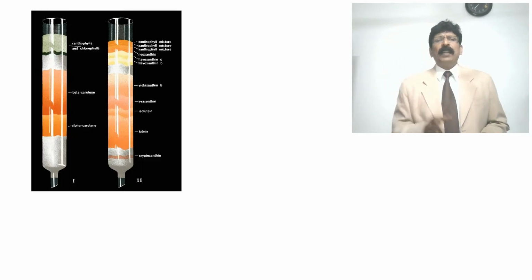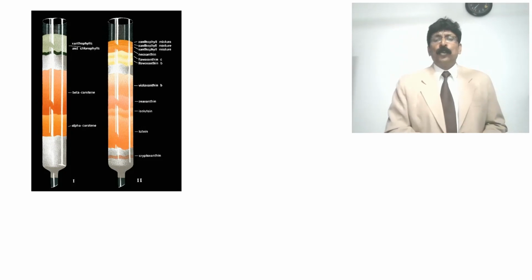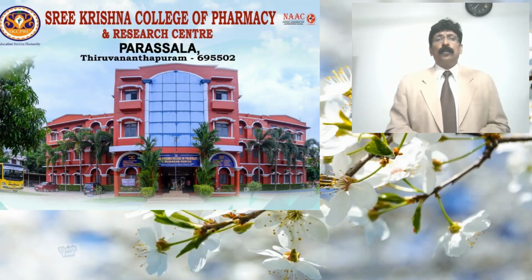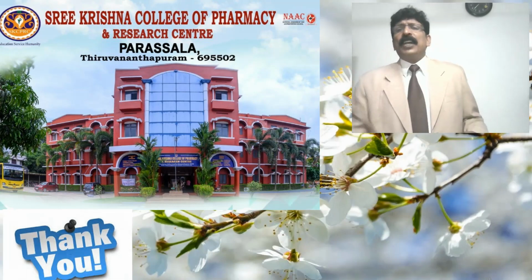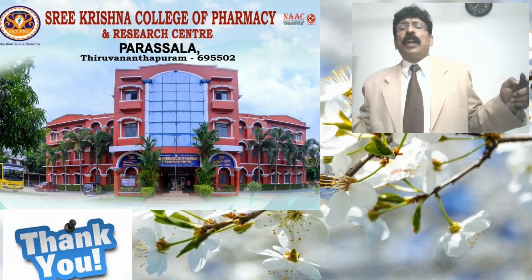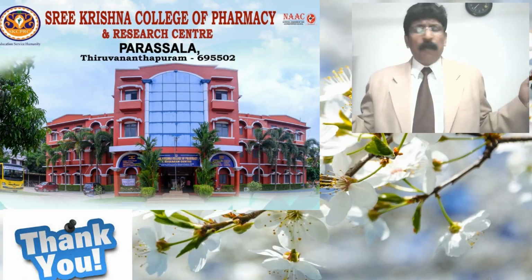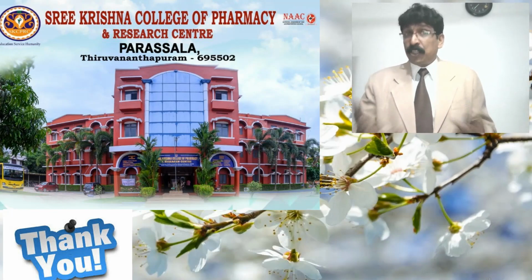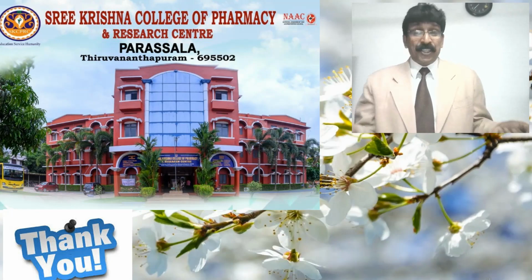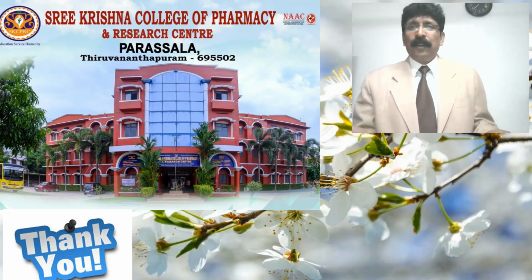So this is simply a picture to show you the column. It's a glass tube. Actually, this can even be prepared with plastic tubes cut into shape. Anyhow, this is a small class on column chromatography, and the basic thing I want you to understand is what chromatography is. Chromatography is a technique used to separate a mixture of compounds. And now I hope you have at least an idea about adsorption and partition chromatography and a basic example of column chromatography.